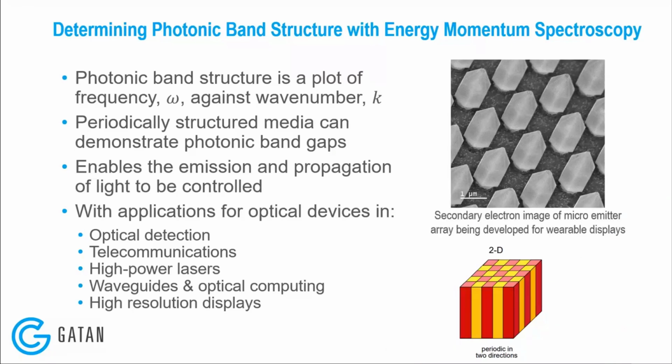And as an example of one of these materials that people are looking at for high brightness, high resolution display type applications, there are micro emitters, micro LEDs. So these are patterned compound semiconductor materials that have a certain lattice arrangement where the emission from a single pillar is influenced by its nearest neighbor. So here is a really interesting use case of a material which has classical compound semiconductor luminescence, but also this enforced photonic effect from the periodicity of the sample.